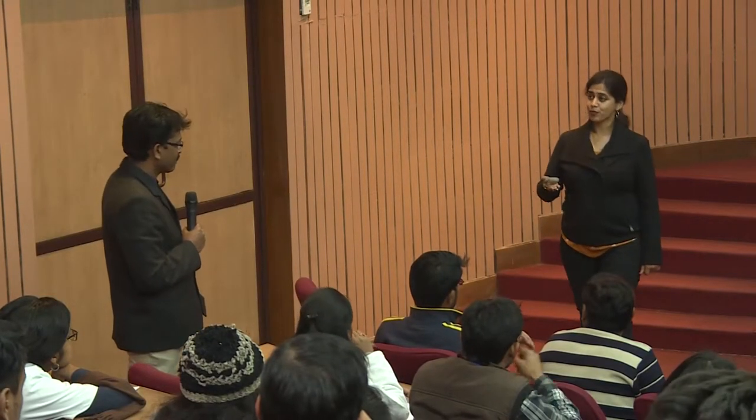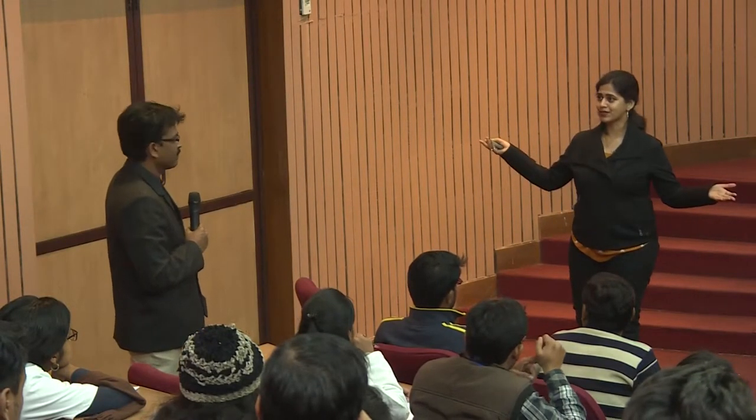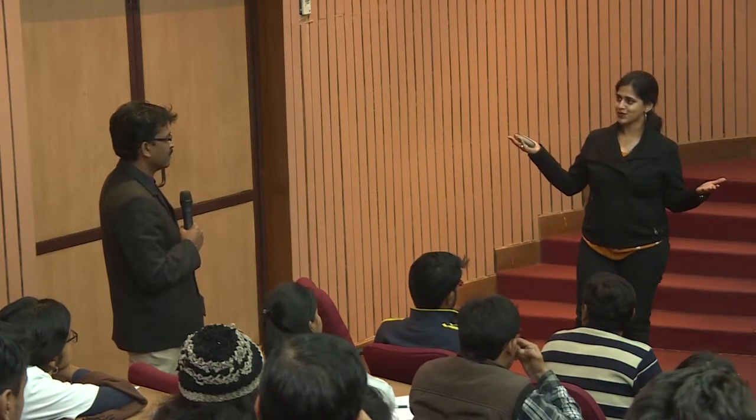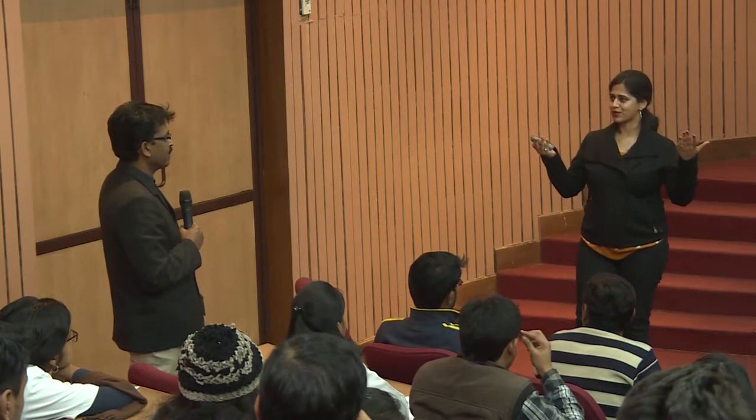It depends again. You can also use the short read technology. For bacteria and so on, short read is good enough. You can also go for PacBio, which will straight away give you one long sequence and the entire bacteria gets sequenced. For viruses also it is a similar case: if you use PacBio, a straight sequence will come and you have a reference to map it. So you can go for PacBio or short read, but it also depends upon the budget, because long sequencing reads are not cheap enough. They are costly. With short read technology, because it's reference based, you can map it easily.